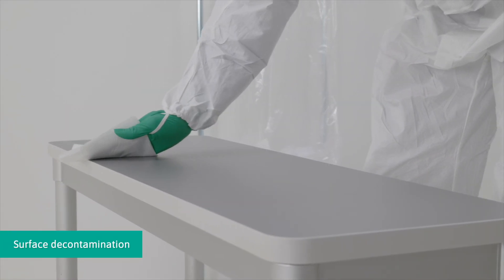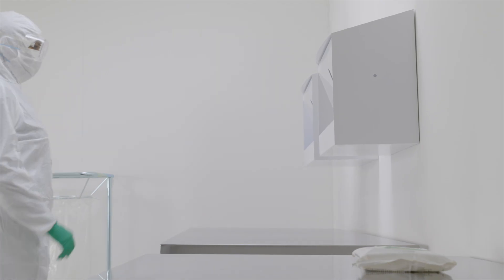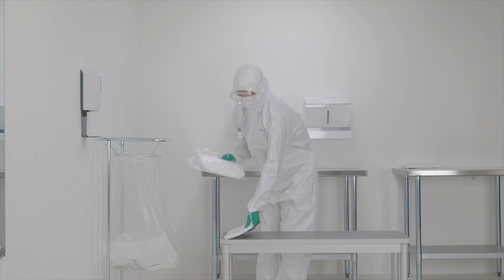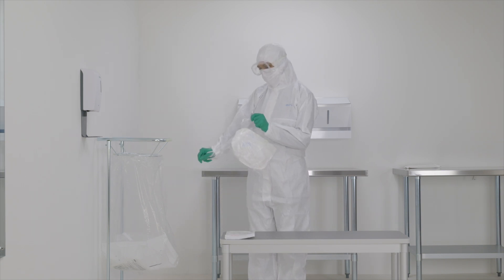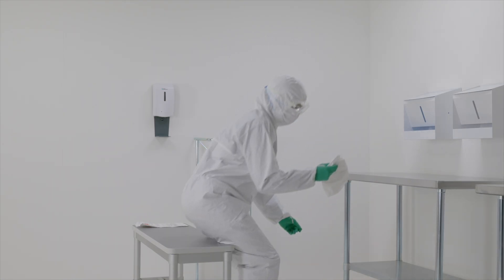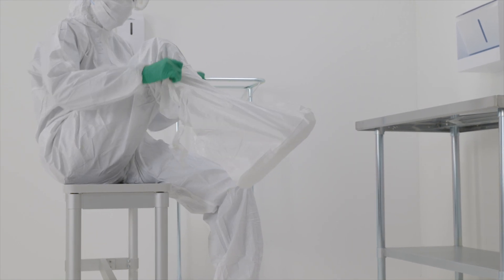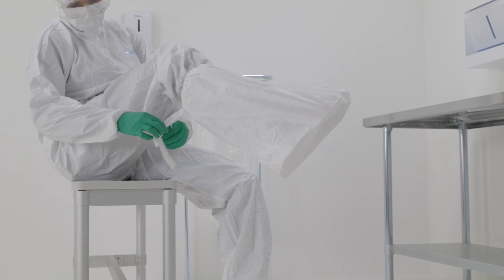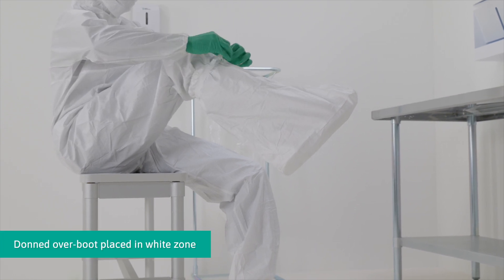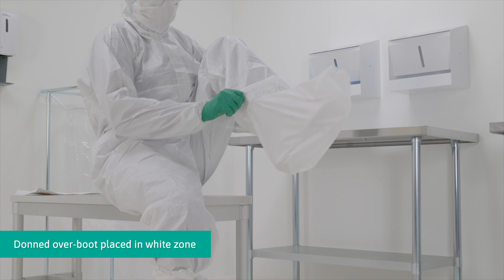Decontaminate the bench with sterile wipes, using a new surface of the wipe for each wiping stroke. Retrieve the over boots from the packaging and pull the over boot over the foot. Fasten the tie strap for a secure fit to the leg. If a crossover bench is used, transfer each leg to the white zone as the over boot is donned. Repeat for the other foot.